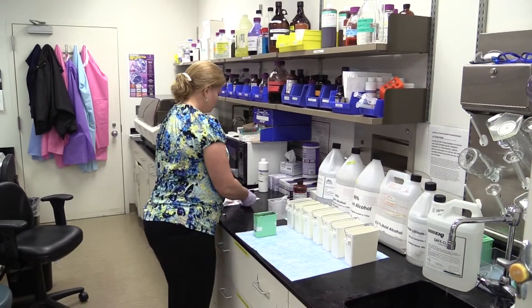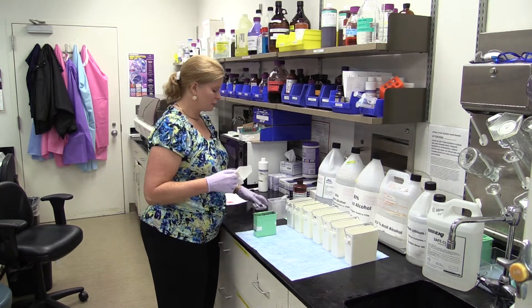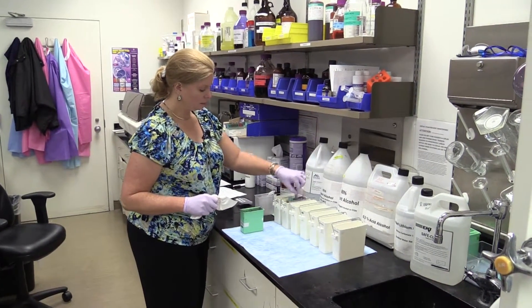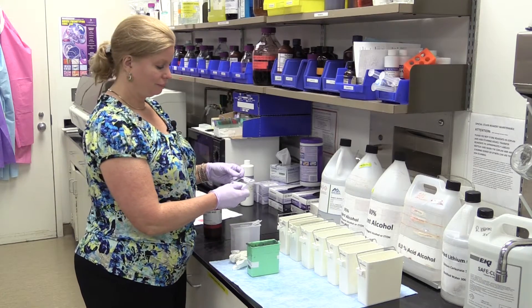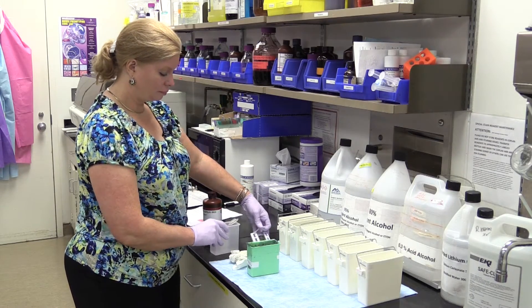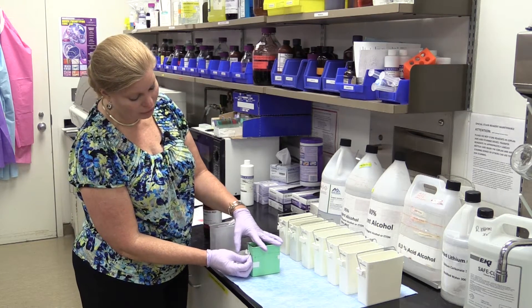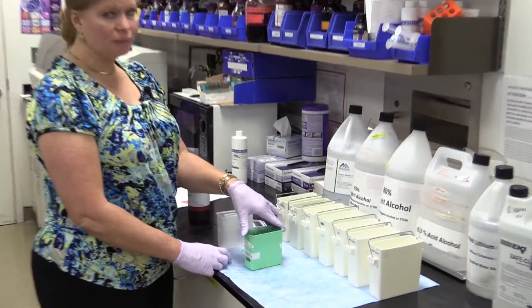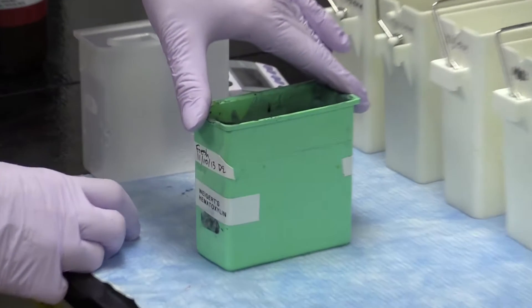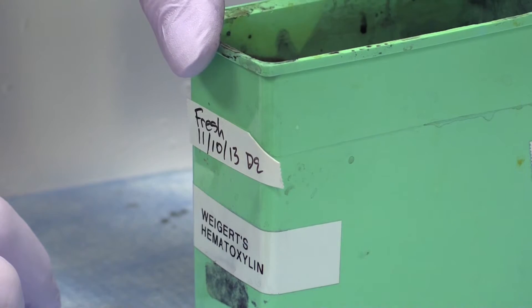Our five minutes is about up for our first xylene. Let's get into our next xylene, agitate it slightly, and then leave it and set our timer again. Since I just freshly made this, I'm going to label it with the date and who made it. This Weigert's hematoxylin will actually last probably up to a week.